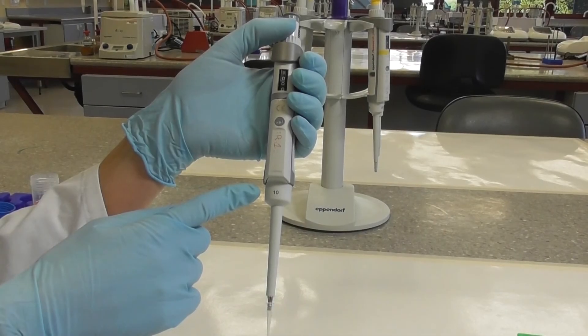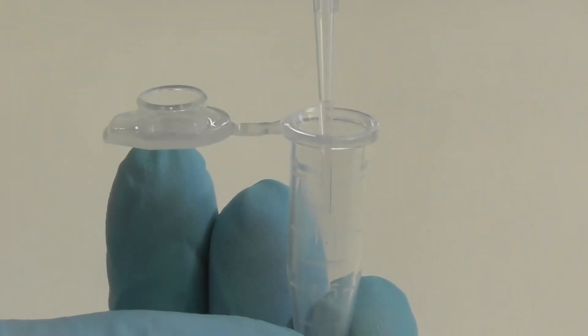When pipetting small volumes such as 10 microliters, a good technique is to observe the volume in the tip after withdrawing your liquid and watch that it is cleanly dispensed into your vessel.